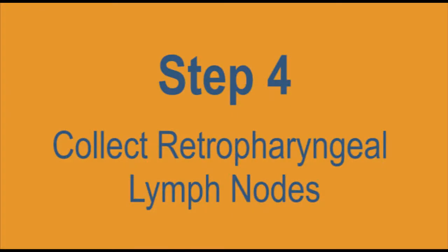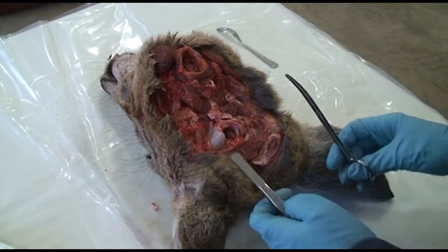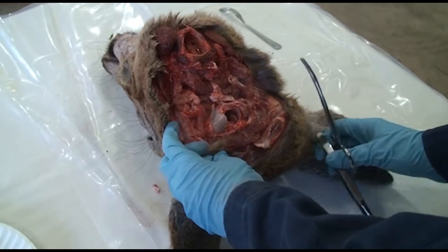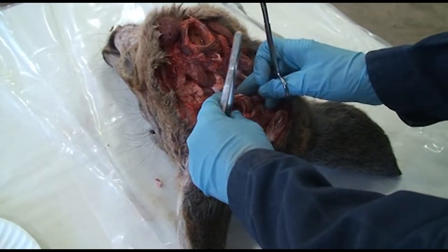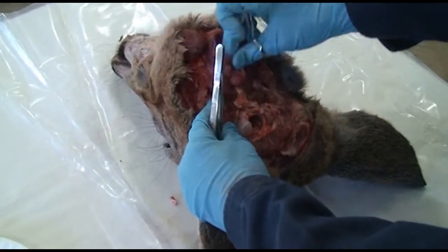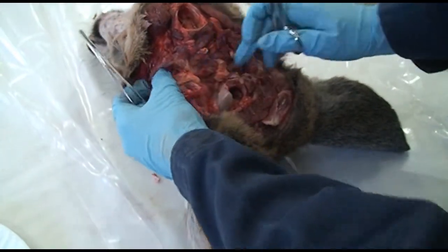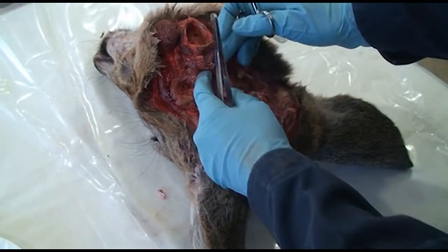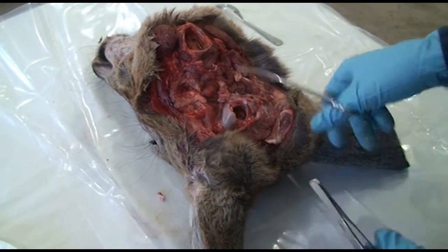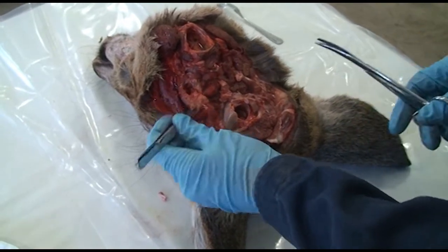Step 4. Collect retropharyngeal lymph nodes. The next step in the process of CWD sampling is to collect the retropharyngeal lymph nodes. The retropharyngeal lymph nodes sit above the occipital condyles, below the trachea and esophagus, and above the muscle hunks that are also sitting right there above the foramen magnum opening where you're doing the sampling for the obex. And they sit to the inside of the salivary gland.